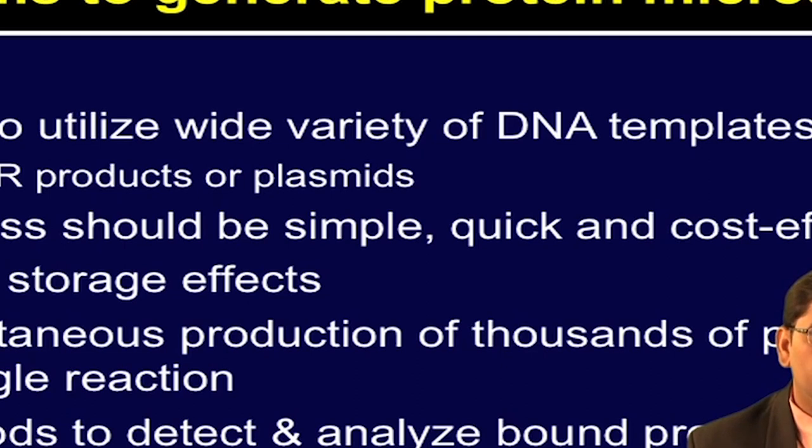Detection and analysis of bound proteins should be simple. It means the assay method and detection technology should be available and very simple. Most of these assays are similar in principle to Western blots or ELISA assays. So, these are quite simple. Detection assays are also simple, so that the readouts can be obtained from common instruments.